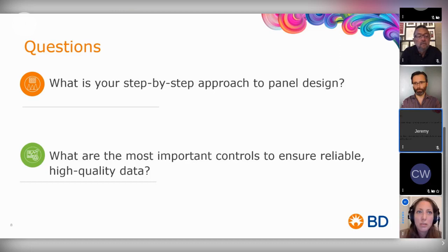And here I just want to add a note of caution. With PE-Cy7, everybody can see that it's a tandem. It's in the name, there's no question there. But a lot of the newer reagents kind of hide their identity. They just have one short name and you don't necessarily know if it's a tandem or not. So just as good practice, use the actual reagent that you use on your experimental samples to stain your compensation controls.